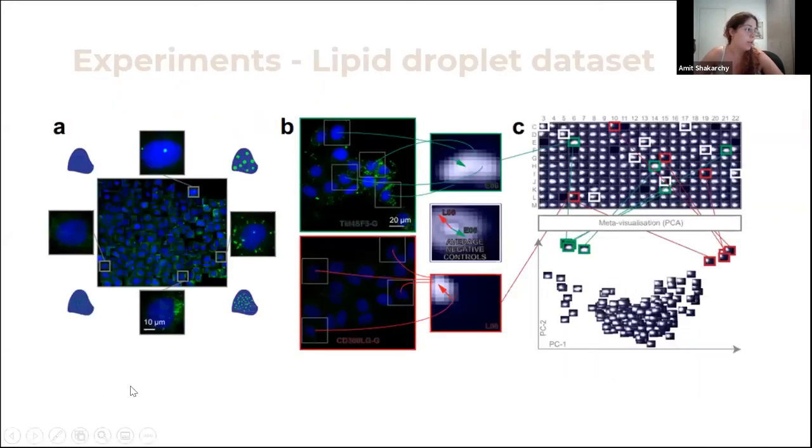So it was just a bunch of calculated features over the images. And when we're looking over here, the user sees the image itself, but the input to the model is the trajectory of all the features that were calculated. Yeah, I know. So the trajectory in this two-dimensional space, right? Mm-hmm. So the question, when you have a trajectory, you need to do feature extraction from this trajectory. And my question was, what were the features on which they based the prediction? You have a trajectory in this two-dimensional space. You extract features. How? This is my question. And then based on that, you do prediction.